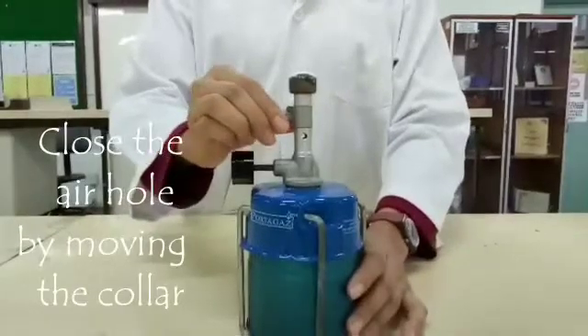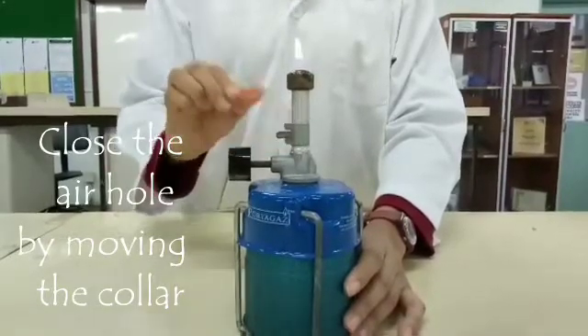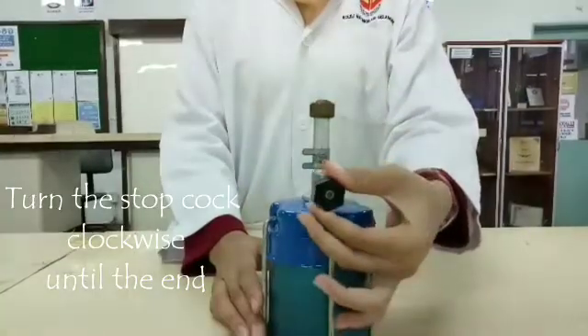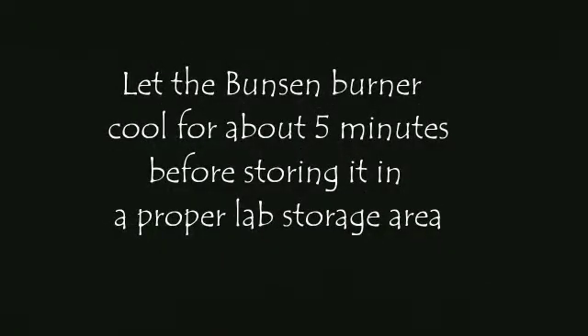Extinguishing the Bunsen burner. Close the air hole by moving the collar. Next, turn the stopcock clockwise until the end. Then, let the Bunsen burner cool for about 5 minutes before storing it in a proper lab storage area.